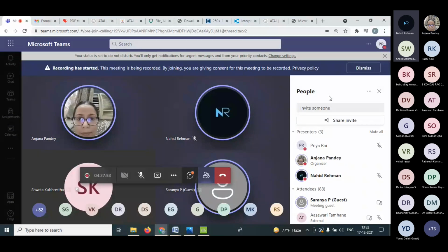You have to again go to the graph, and then first you have to design and put the variables. Then you will get the run structure. Then you do your experiment. Then you enter your response, that is your result. And then you select all the runs along with the result, select the DOE, go to analyze and then go to the ANOVA. You will get all the options. You just try and you will get all of them. Then you represent your data in the form of a surface plot and a contour plot, and in the end you select the optimization and you will get the optimized values.